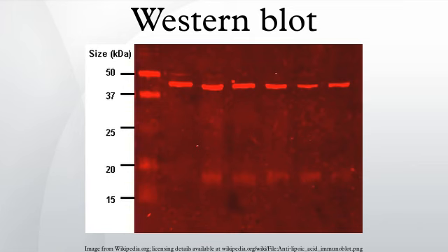Radioactive detection: radioactive labels do not require enzyme substrates, but rather allow the placement of medical X-ray film directly against the Western blot, which develops as it is exposed to the label and creates dark regions which correspond to the protein bands of interest. The importance of radioactive detection methods is declining due to its hazardous radiation, because it is very expensive, health and safety risks are high, and ECL provides a useful alternative.